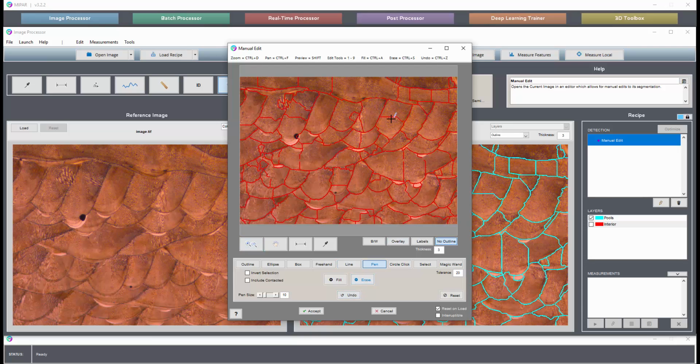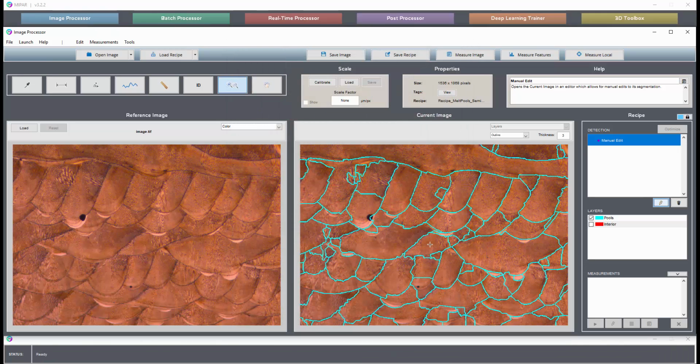Let's cross these out here, cross this out here. Could move through this image in about 2 to 3 minutes. Wipe all this out. You'll usually find additional things to correct once you've made some of the removals.